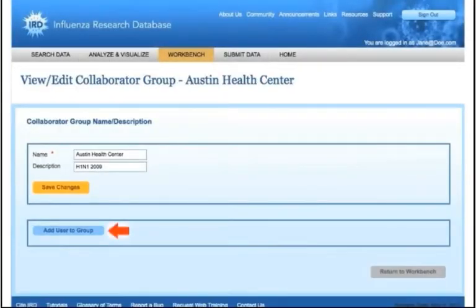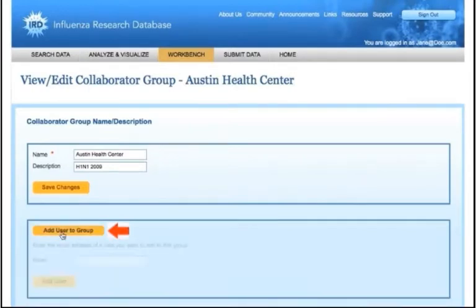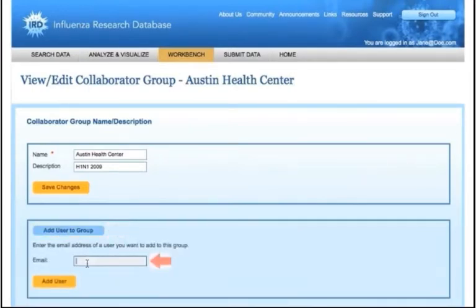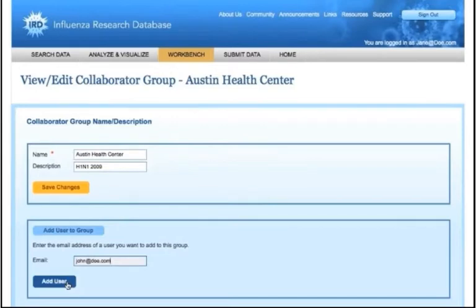You can then add one or more users to the group by clicking the Add User button and entering the email addresses in the provided boxes. Click the Update button to add the users and repeat the process if necessary.